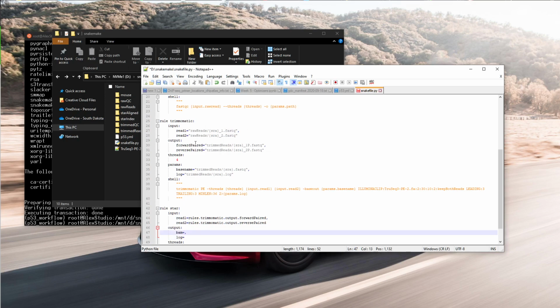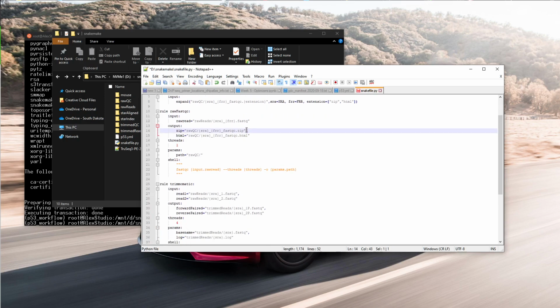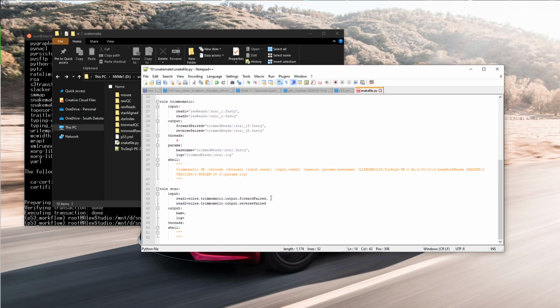So something that I noticed going through, I will often forget the comma at the end, just because usually when coding in like R or something like that, if it's a single line, like if you're setting a variable, you don't have to put a comma at the end. So it's just something to get used to, but yeah, don't forget the comma.